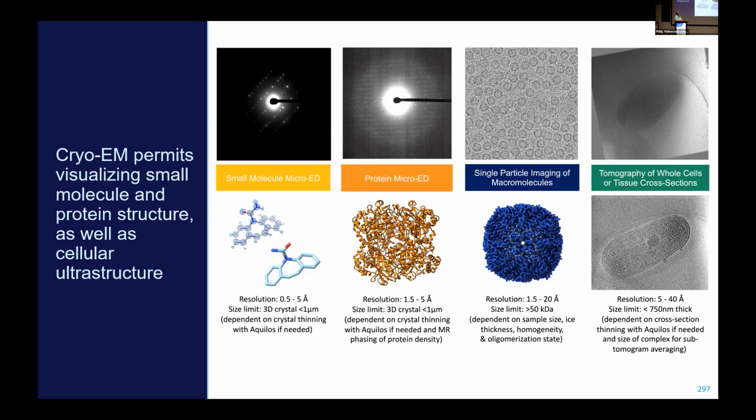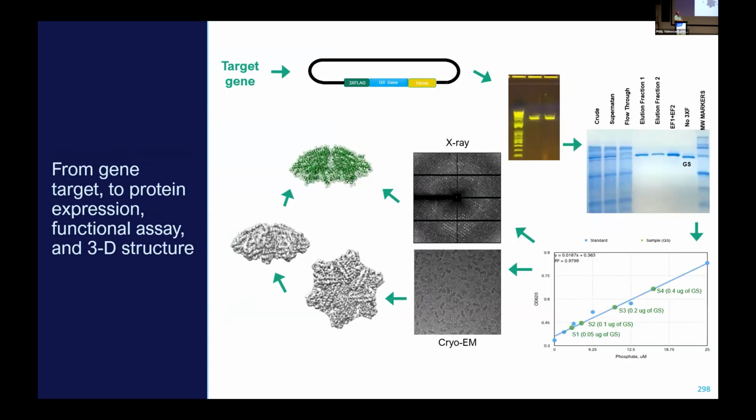So cryo-TEM is one of the core capabilities, but another core capability is the cell-free pipeline that we developed about 5 years ago. This allows us to start with that gene or protein sequence at the very beginning. As I mentioned, a user could provide just the UniProt sequence of your protein of interest. We get that into a clone compatible with our cell-free pipeline, and then we can do expression, purification, and then scale it up for either functional or structural analysis.